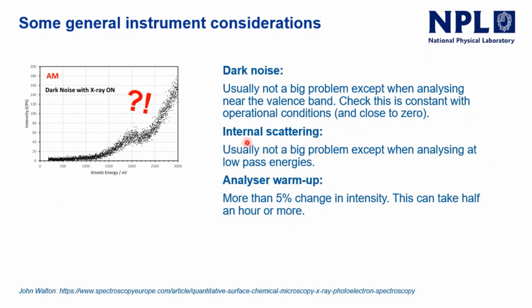The other thing to look out for is internal scattering. All analyzers scatter things internally, and we did find some instruments had some significant internal scattering. Others were fairly good and didn't have much that was detectable.